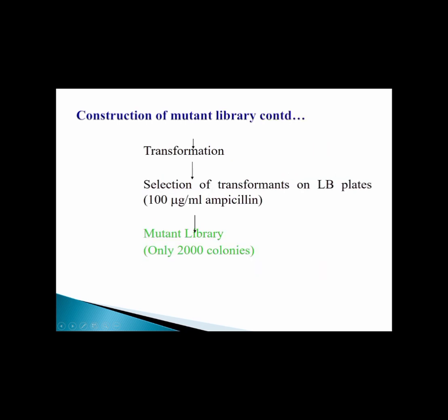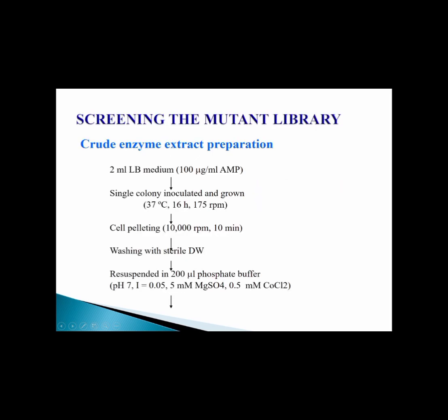Construction of mutant library continues by transformation, then selection of transformants on LB plates with ampicillin as an antibiotic marker. We have constructed a library of 2000 colonies.